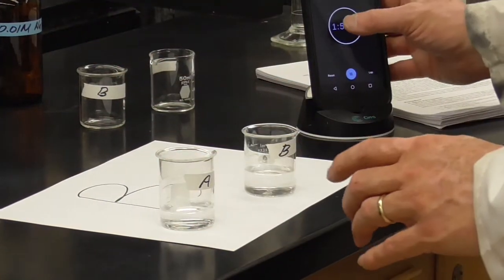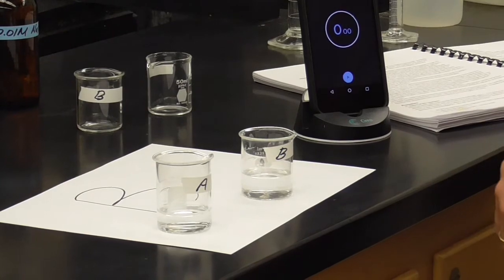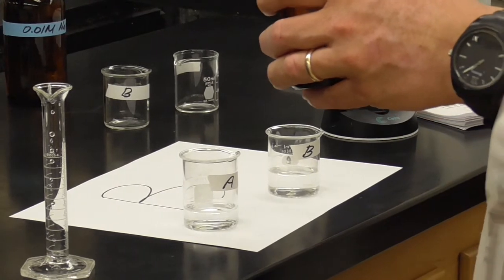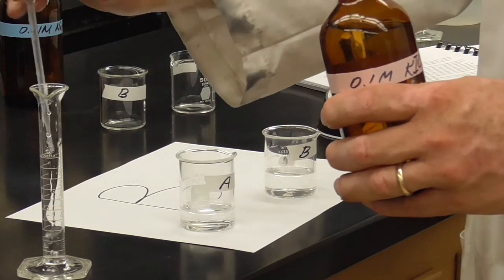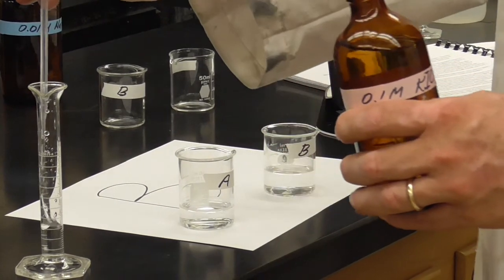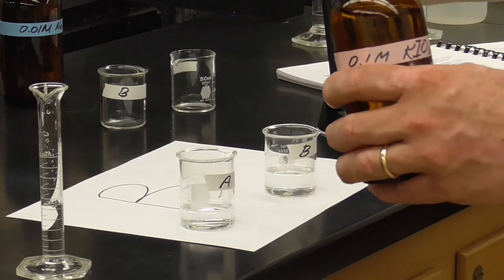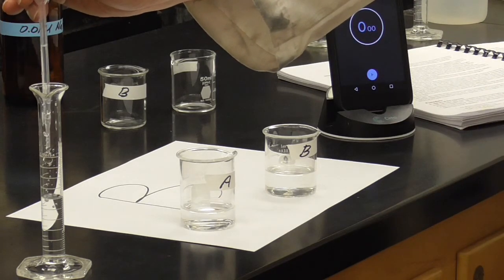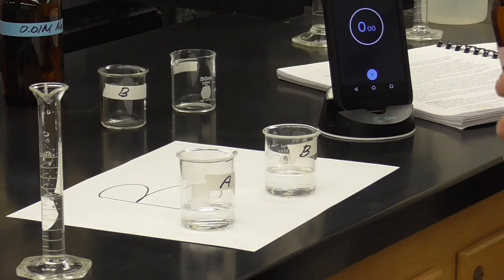And trial 3, this time we're putting 6 milliliters into A. So 3 times the amount of the initial. Go, there's 6.